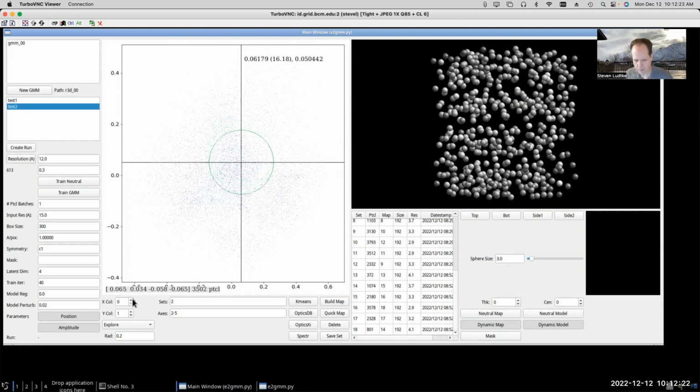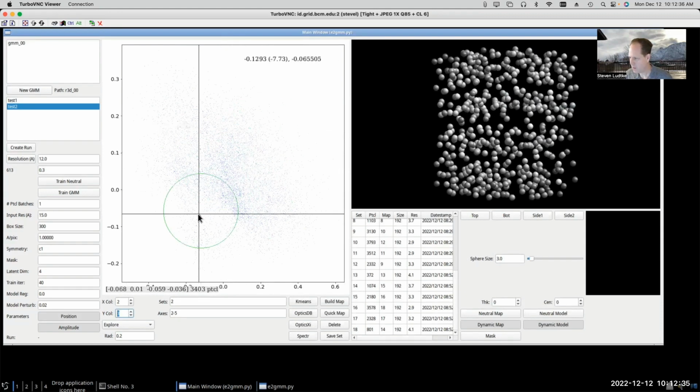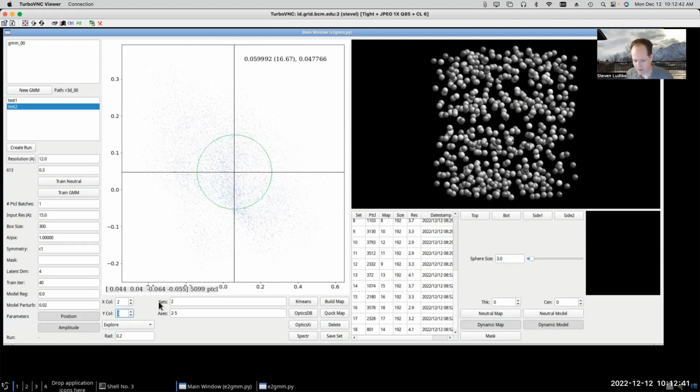I could also look at some of the other axes, right? I could look and see what axis, say, 2 versus 3 is. And we could see, because somewhere in there, oh, it looks like that direction actually seems to correspond pretty well to the motion too. Anyway, I could pick an axis and I can try and do it.